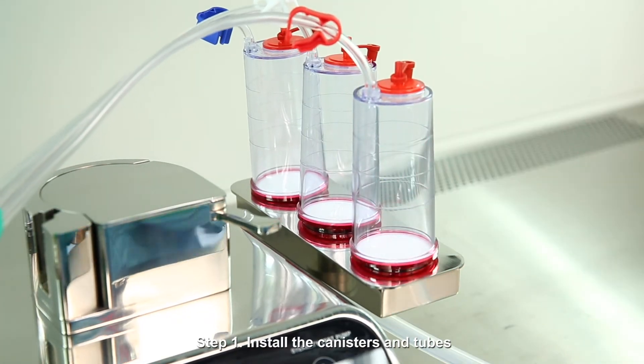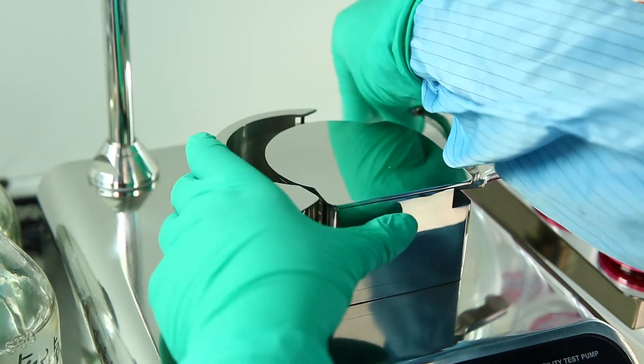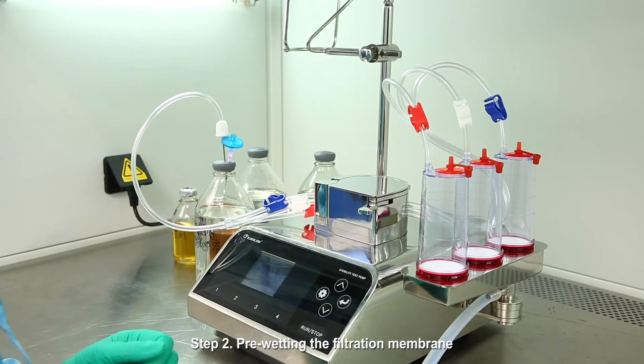Step 1: Install the canisters and tubes. Step 2: Providing the filtration of the membrane.